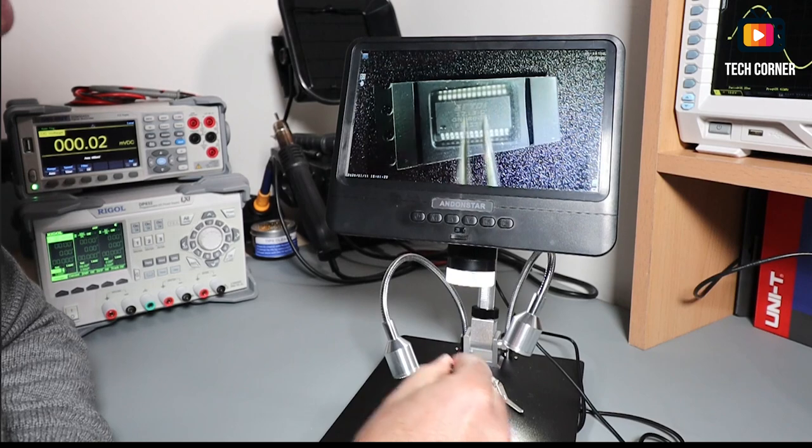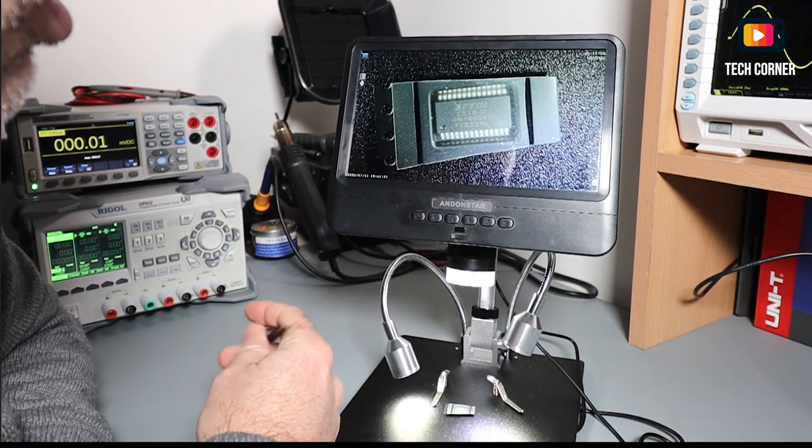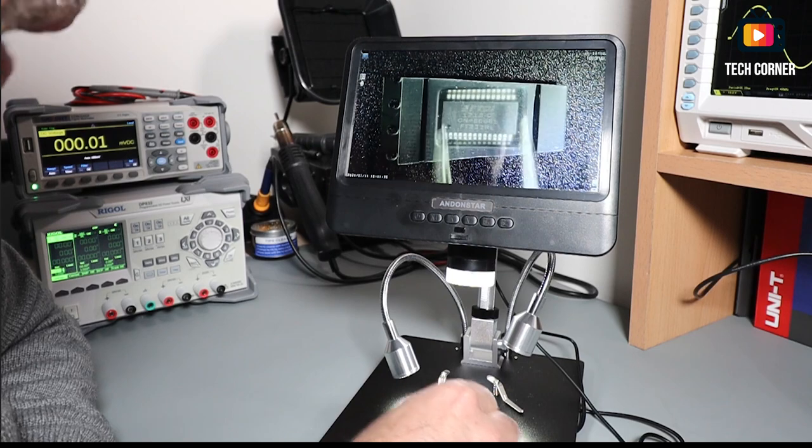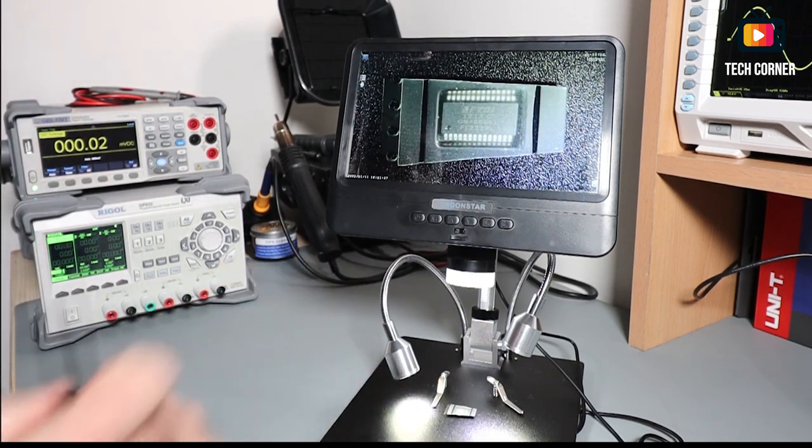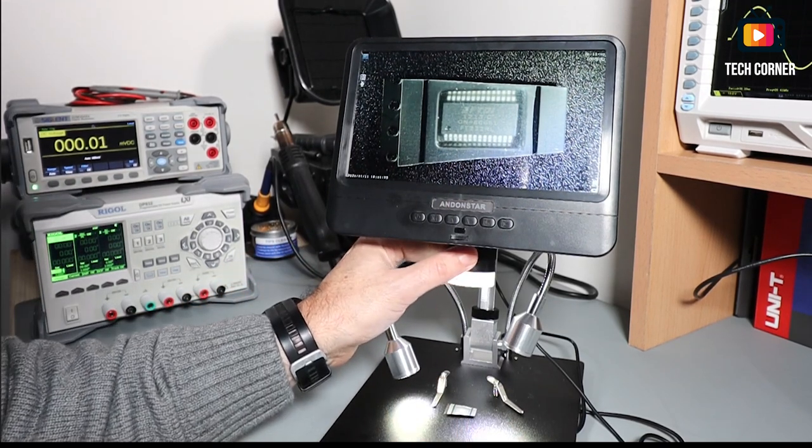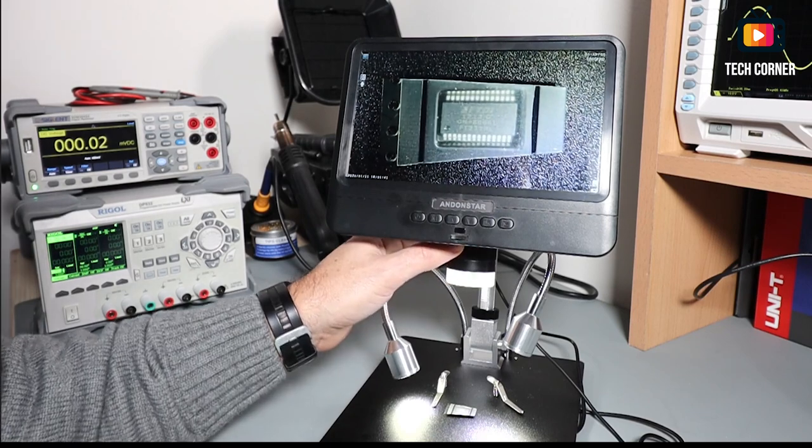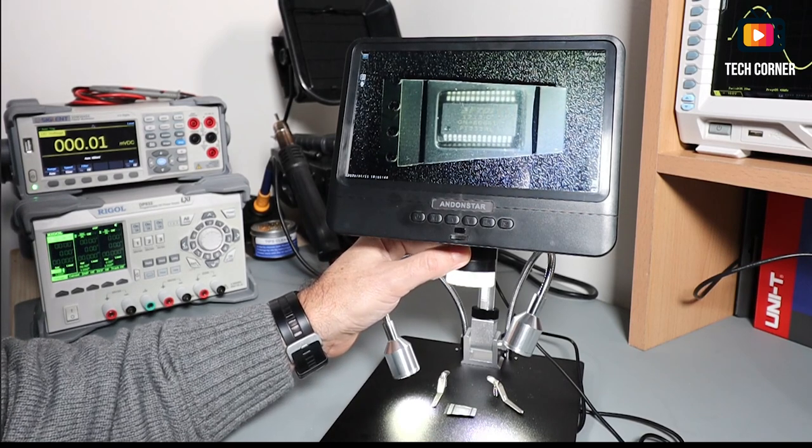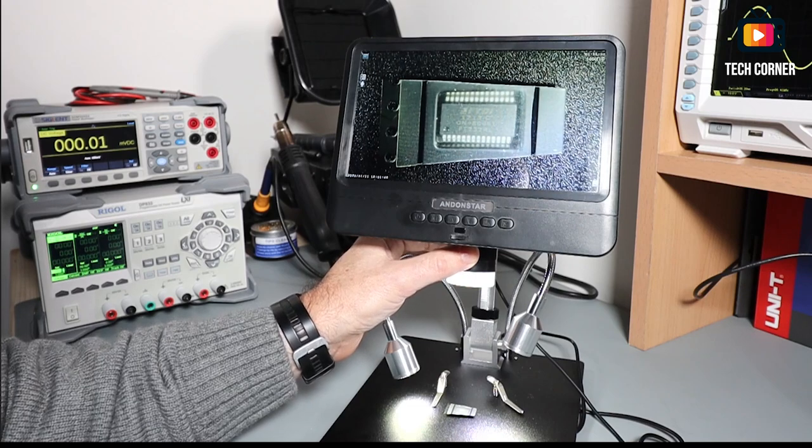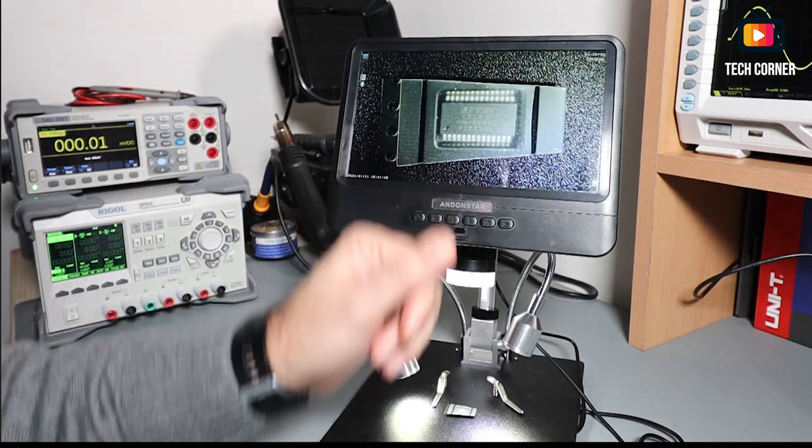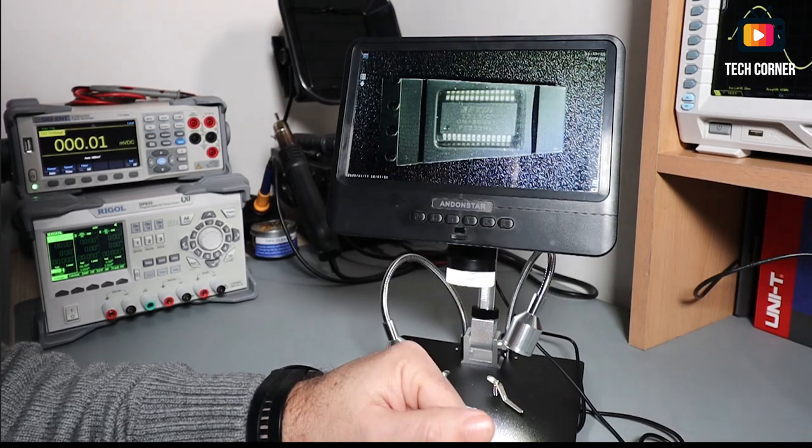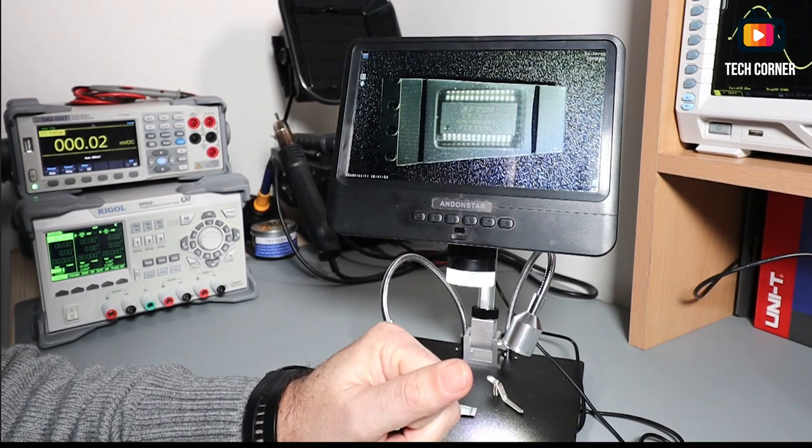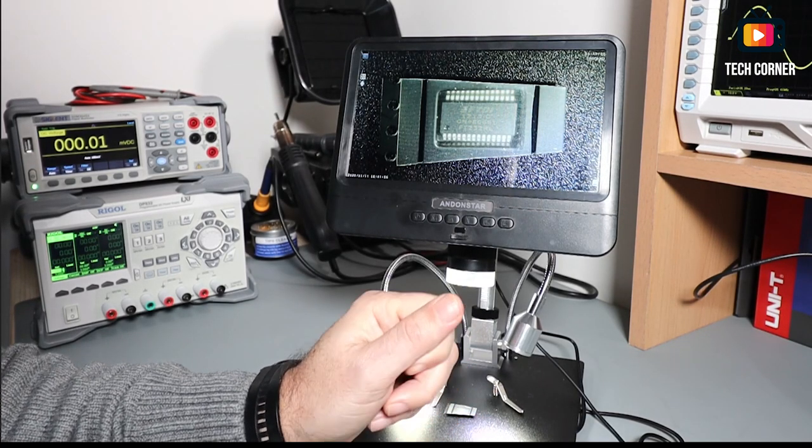You can see here an integrated chip inside the packing. Let's try to focus a bit more. The focus is done here. It's manual. But even so, it's very easy to focus. As you can see, we can read perfectly FT 232 RL. It's a USB controller.